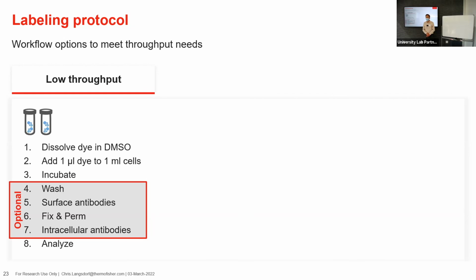It's true, yeah. And so some of those things, if you're going to do something different, just try it and see. Some of them, there is some flexibility there where you can use 1/10 of the dye and it still works okay, but not for all of them. So if you want to do something interesting, give it a shot. But generally, the protocol is kind of designed to give you the best results.